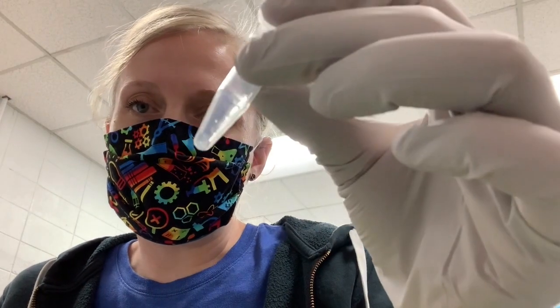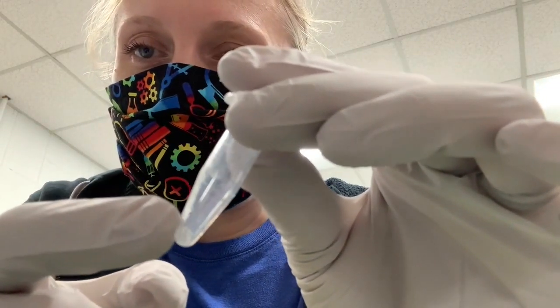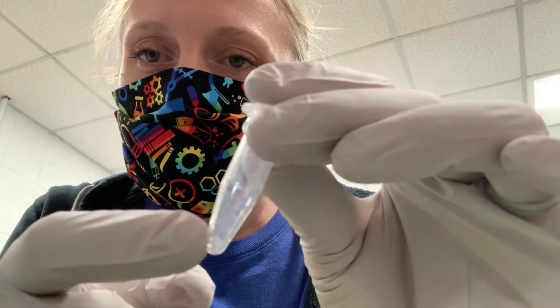At the end of that 5 minutes, you should be able to see that your pellets are still there, but there's really no liquid left. You've removed all of it and kind of given it some bonus time. You might see a little bit of clear or glassy residue up the tube. That can be part of the pellet too.